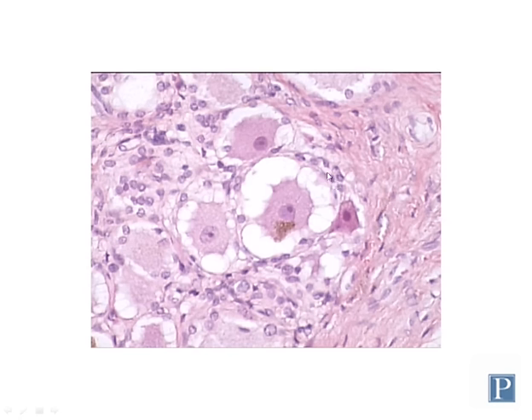Satellite cells get their name because they're found all around the outside of these pseudo-unipolar neuronal cell bodies, as if they were orbiting it. This is only one place you can find satellite cells. Satellite cells can be found surrounding other types of neurons and ganglia as well. So be able to distinguish between satellite cells and the neurons within a dorsal root ganglion.